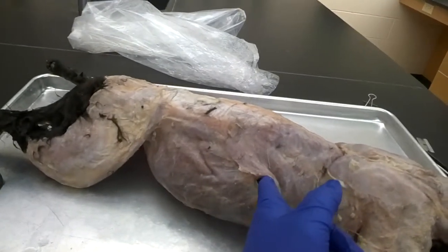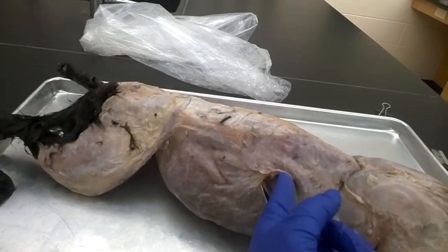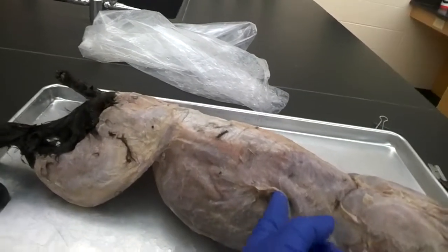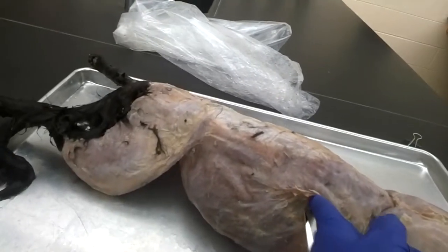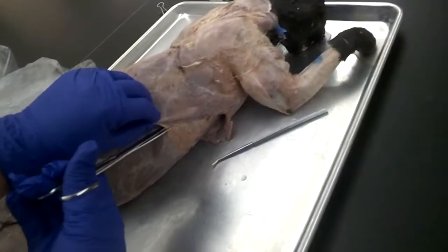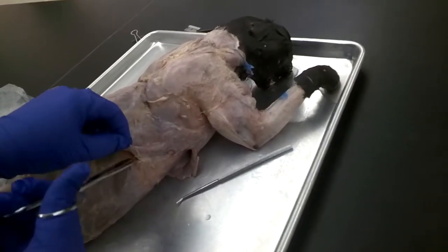Very small snips with the tip of your scissors can also help. Always make sure to keep the tip of your scissors pointed up and out of the body — you don't want to push it inward and cut away from yourself, because you won't be able to see if you're cutting into something you shouldn't be. Once that's separated, we can also move down from the front along that line very gently.